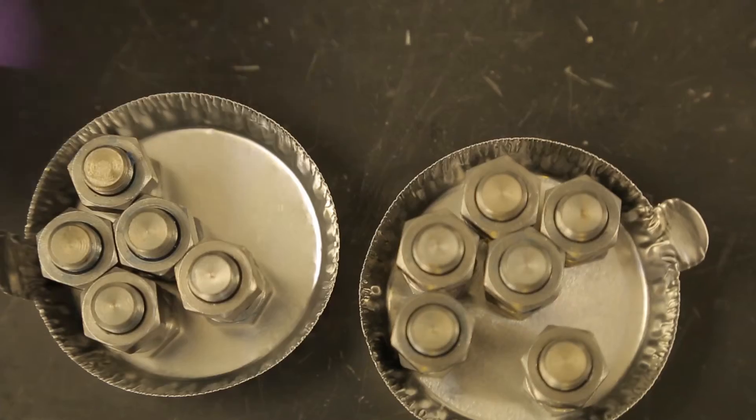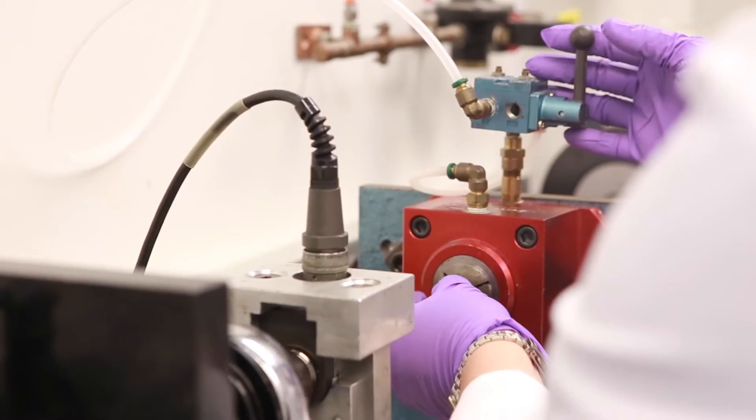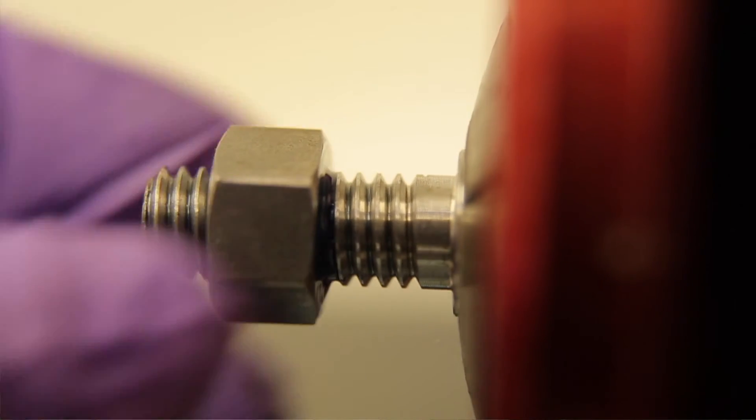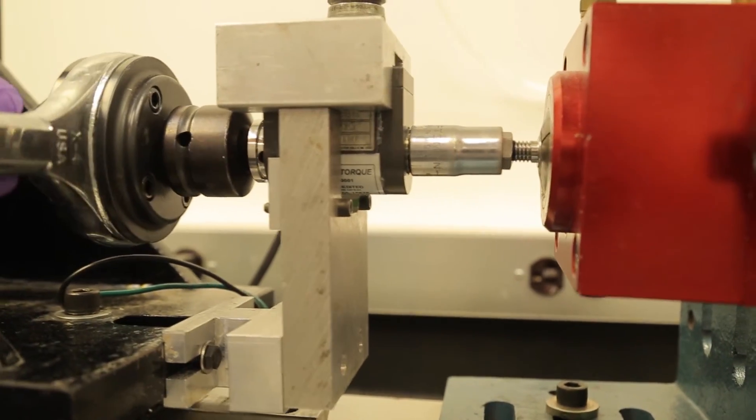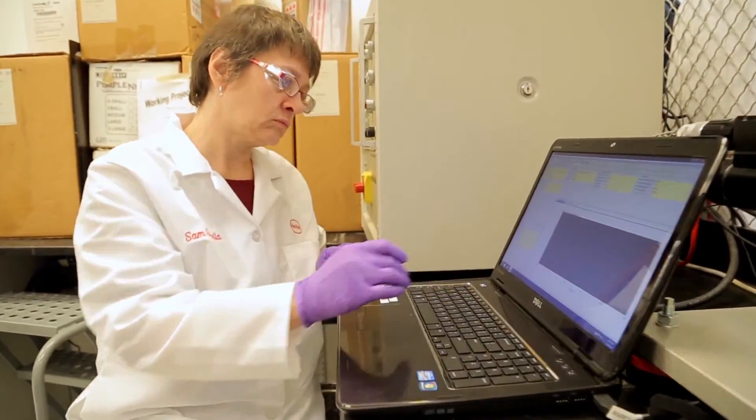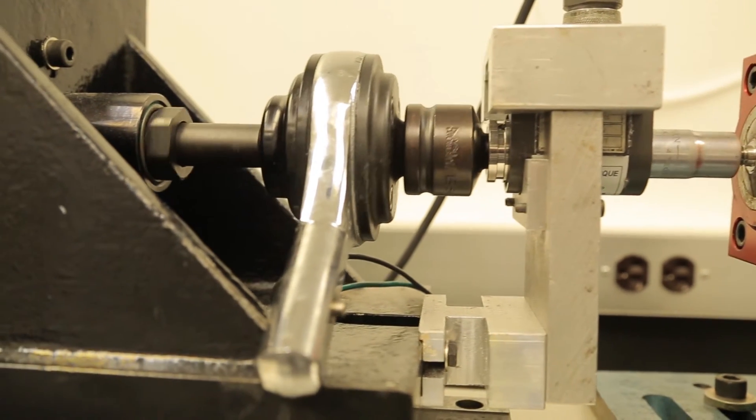One way we test these adhesives is by using straight threaded fasteners like nuts and bolts. A bonded assembly is seated in the torque tester and tested at a defined rotational speed. The initial result recorded is the strength of the first break in the cured adhesive.